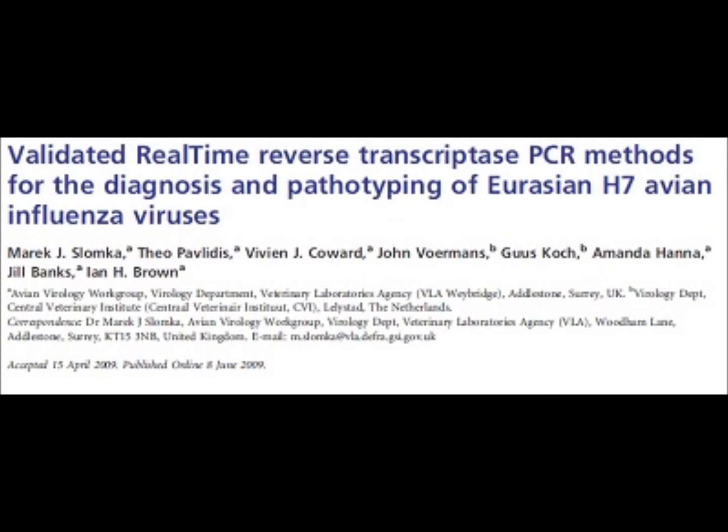So for instance, if a company is shipping things out to, let's say, a faraway place, there's transport, there's the kits reaching the lab, they open it, and they want to use it for a few months. So you need to be sure that it is stable in liquid form for the period of time that people are going to use it.